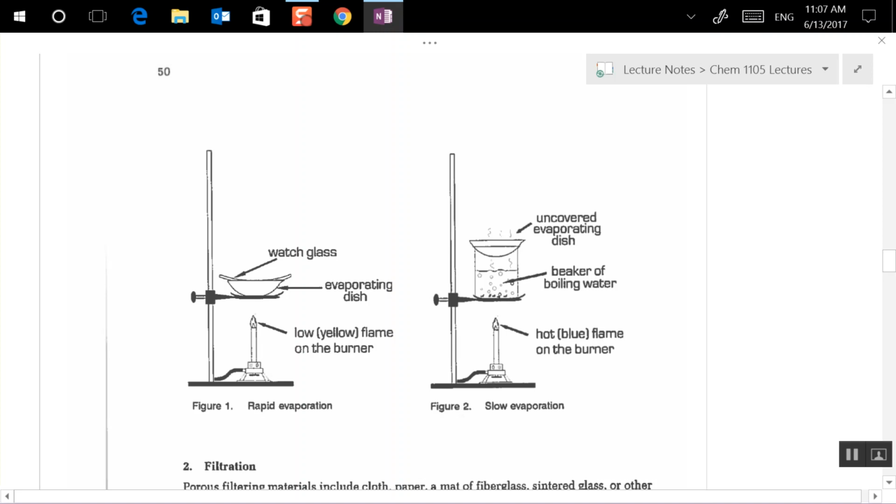So the water-soluble thing that you got, you can actually identify if there was something water-soluble by boiling away the water. Otherwise, you won't even know if there was something there or not, because you won't see it dissolve and you won't see it when it's in the water. So to find out if you actually had a water-soluble thing, you have to verify that by evaporating the water.